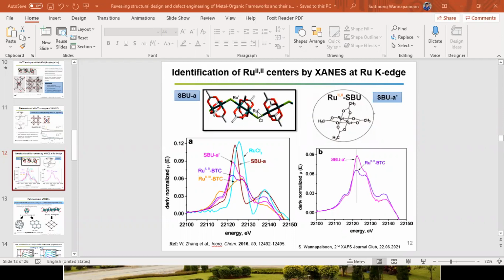Okay, we have another work which is not exactly what I present here. The center is cobalt, and we also see a change during the catalytic reaction. But in most cases, what we have observed is that the coordination number changes, because the starting materials, byproduct, or product at the end is still binding to that catalytic active node. So we get a deviation in the XAFS, not only about the coordination itself, but also the geometry, because of a slight flip of the structure inside the periodic structure. That is also what we have observed in the XAFS analysis.